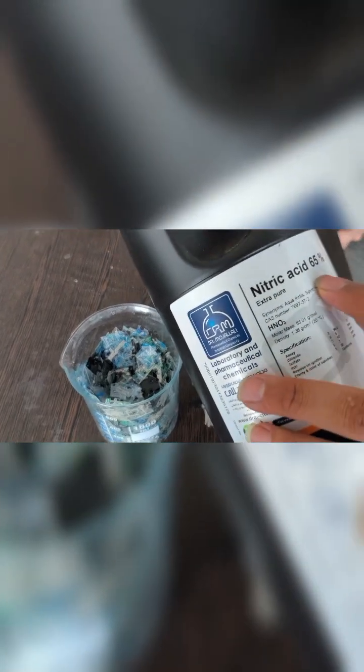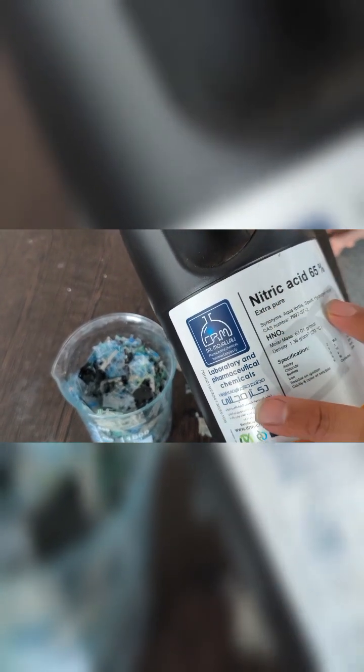Soak in nitric acid. Place the chopped film pieces into a beaker or glass container. Add concentrated nitric acid, 65%, until the material is fully covered. Wait approximately 3 hours for the acid to dissolve the silver. Afterward, strain the mixture and rinse the solids with distilled water to remove any remaining acid.